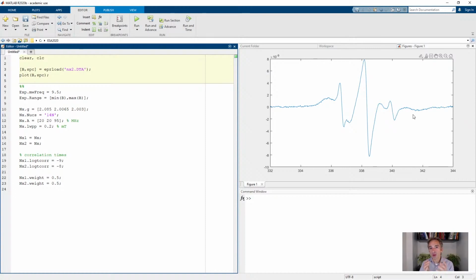And this is very typical of, let's see, a nitroxide spin-labeled protein where you haven't been able to completely separate out some free spin label reagent that's still in solution. So your EPR sample will contain nitroxide either attached to the protein, where it's less mobile and gives a broad spectrum, or still free in solution, where it's much more mobile and will give these 3 sharp lines. With EasySpin, you can just simulate both components at the same time. And you can still make use of this spectrum even though it's contaminated by the free radical.